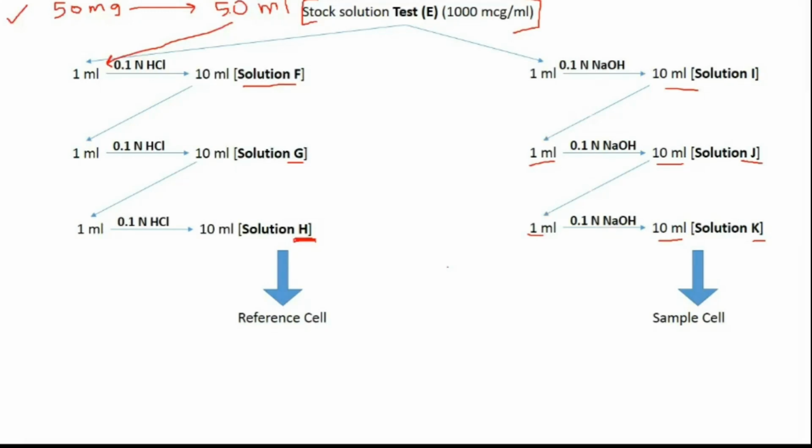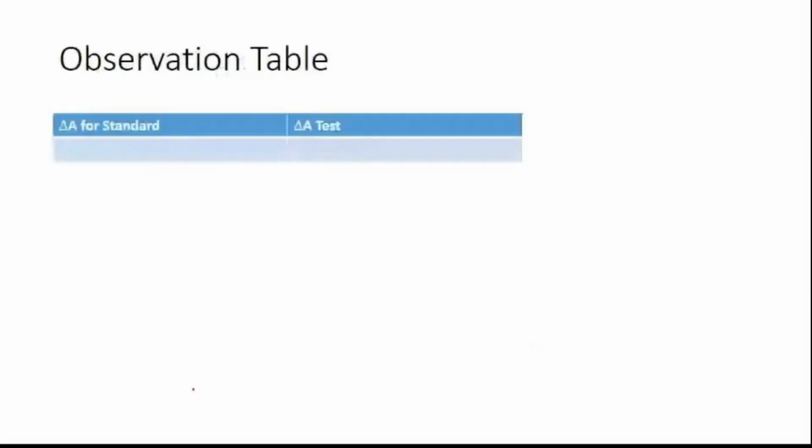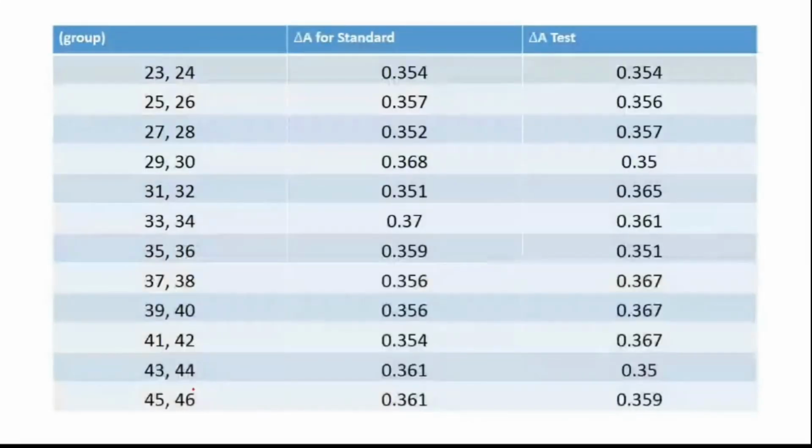You need not calculate the theoretical concentration here because we are going to compare the quantities, not concentration, at the end when we calculate the percent content. So just 50,000 times dilution factor. Okay, let's proceed. Next part, write down observations. Now for everybody I will give you observations. आप ऐसे लिखेंगे. These are your roll numbers and your observations. Please take down your observations. Then let me know when you are done. These are as per your roll numbers.